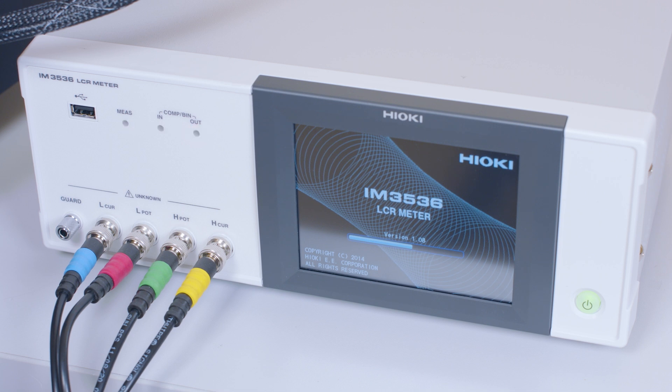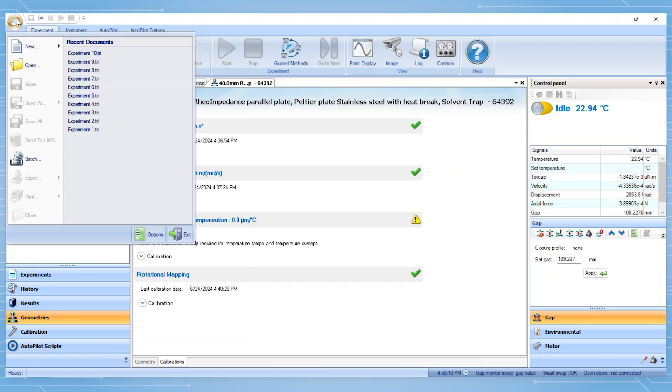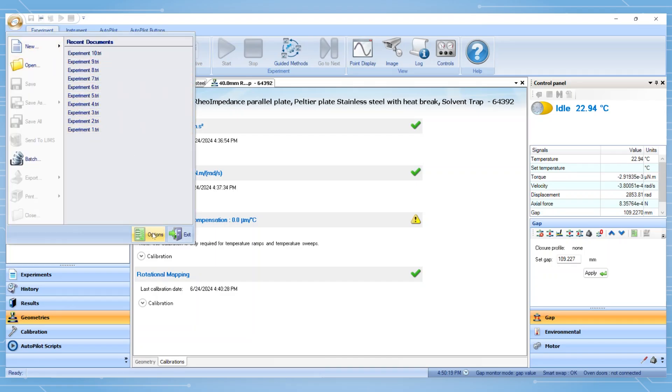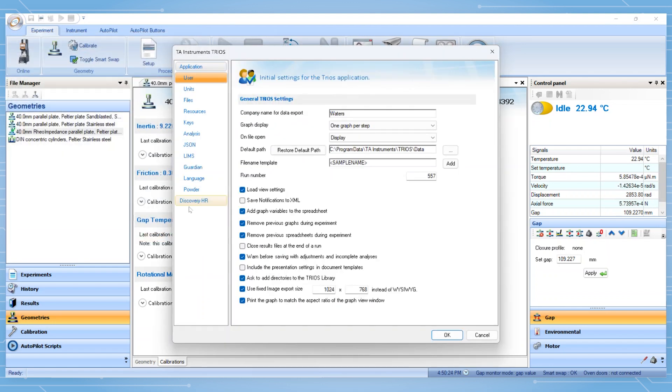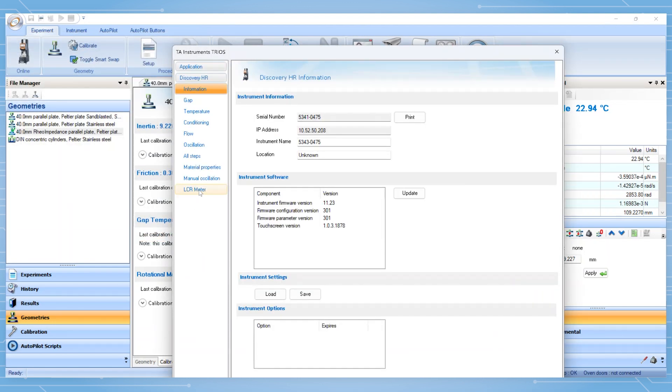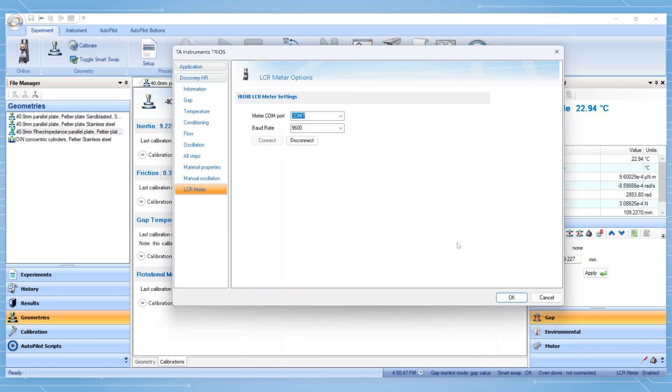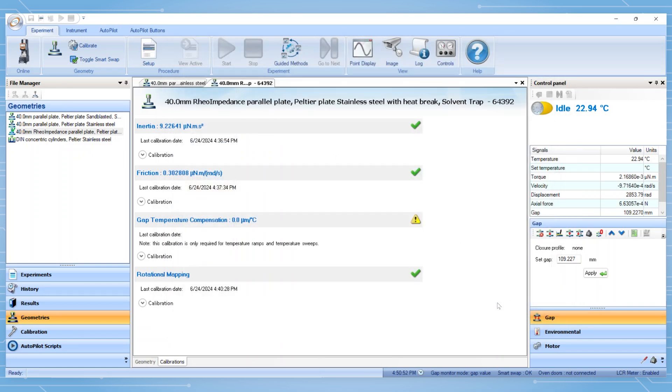If using a Hiyoki meter, go to Options in TRIOS, select the Discovery HR tab, then go to LCR meter. Select the COM port for the LCR meter and click Connect. If the connection was successful, the disconnect button will become active and the text at the bottom right of TRIOS will say LCR meter enabled. Click OK. Please note that COM port assignments may be monitored using the Windows Device Manager.